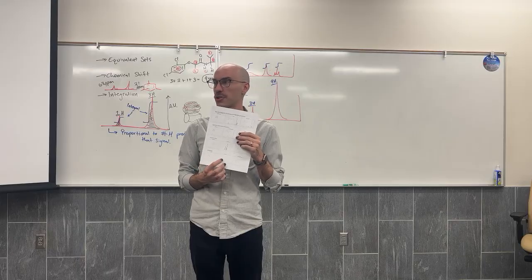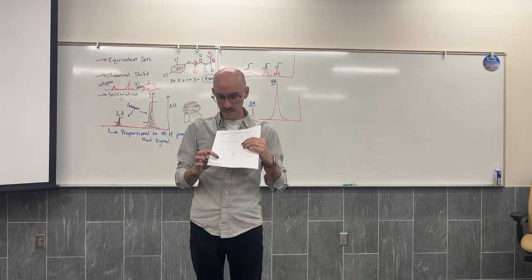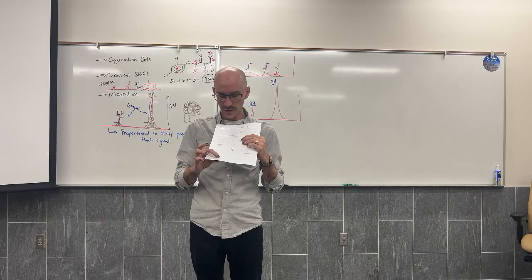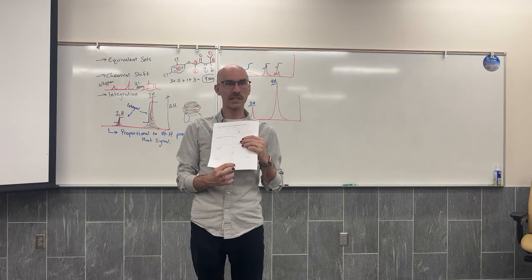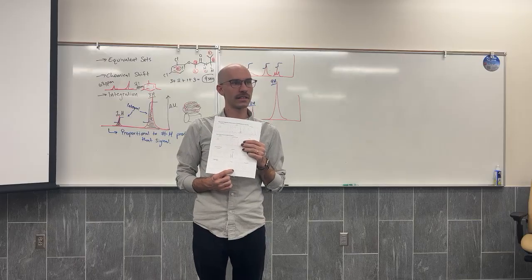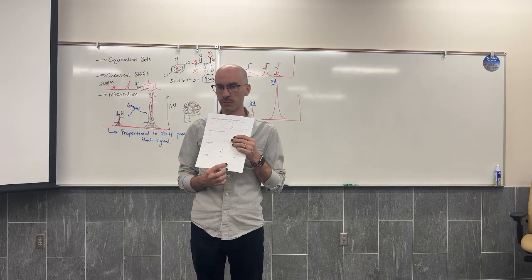But notice how the chemical shift of that signal is different from acetone to 2-butyne? Because being adjacent to a carbonyl shifted it beyond 2 parts per million, being adjacent to the alkyne shifted the signal to the right of 2 parts per million. The chemical shift was different.